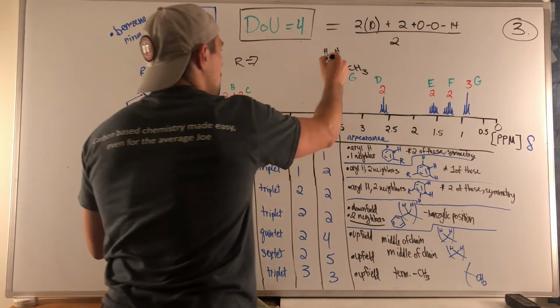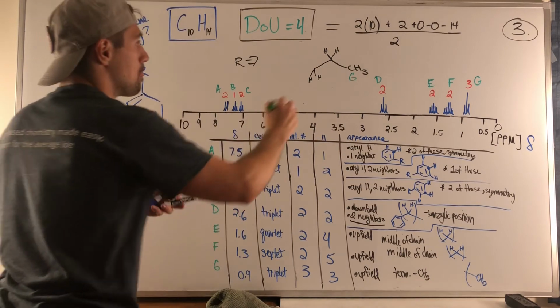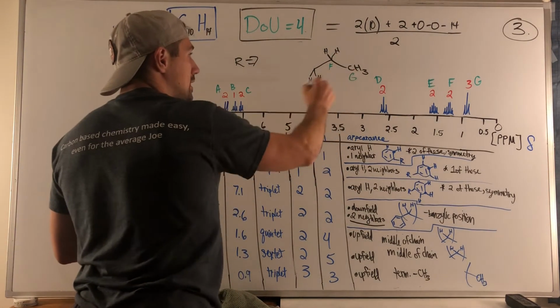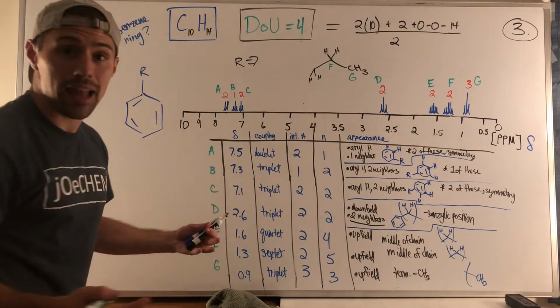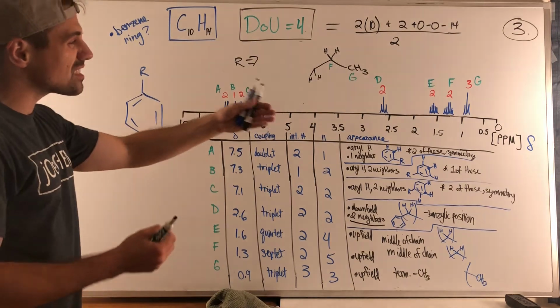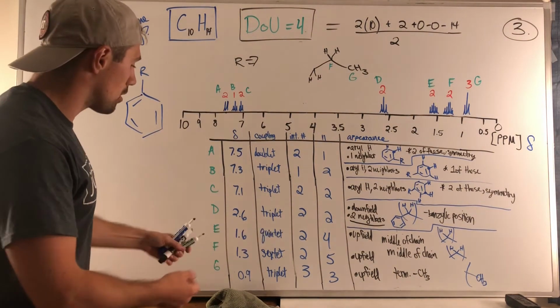And if we just lengthen our chain to be another CH2, this would take care of F as well. Because 2, 3, that's 5. That would make this a sextet. It's in that realm of being upfield, slightly downfield. Wonder where that's coming from. But we can just keep on chugging.